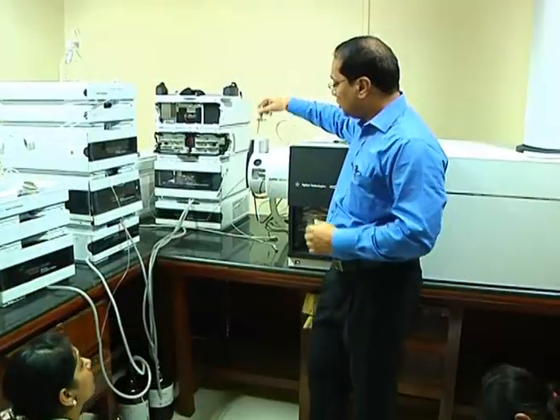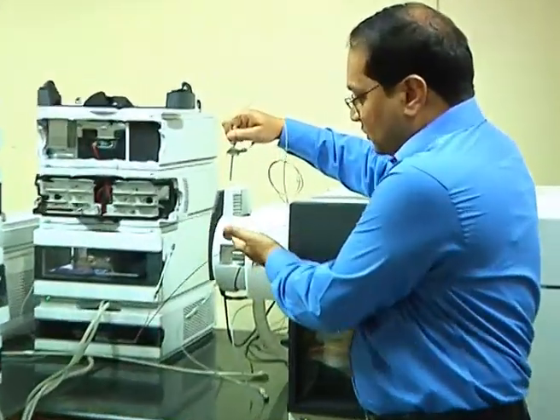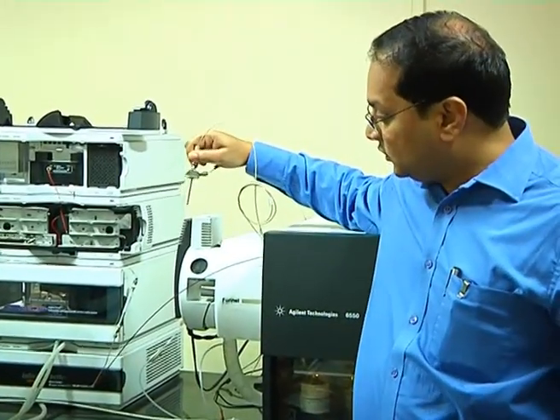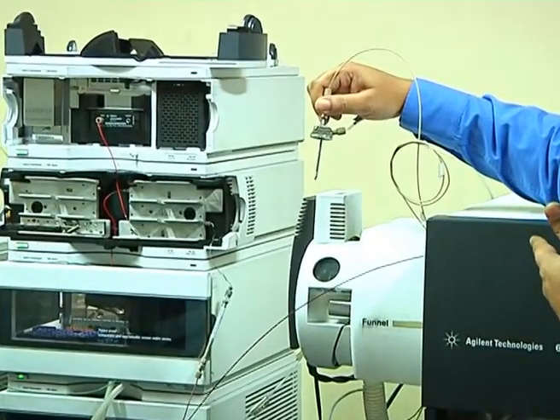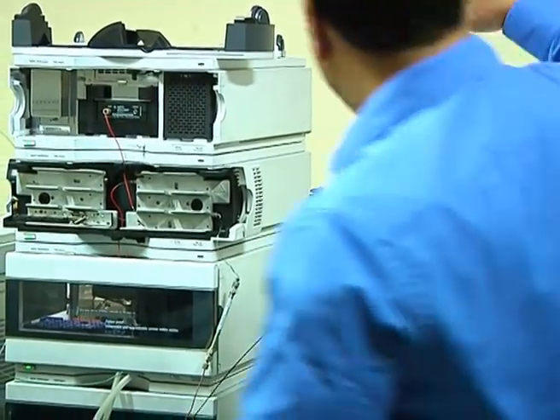Nitrogen has to be an inert gas, otherwise it would react and form something else inside. Right? This is how the spray will happen. Yeah. This is the spray. I showed you the droplet. Now you see the spray. You could see it.